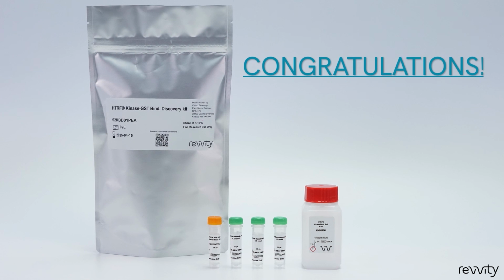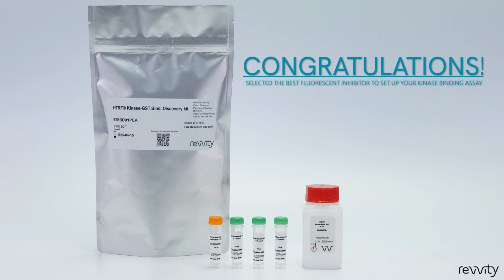That's all there is to it. You can successfully select the best fluorescent inhibitor to set up your kinase binding assay in less than 2 hours.